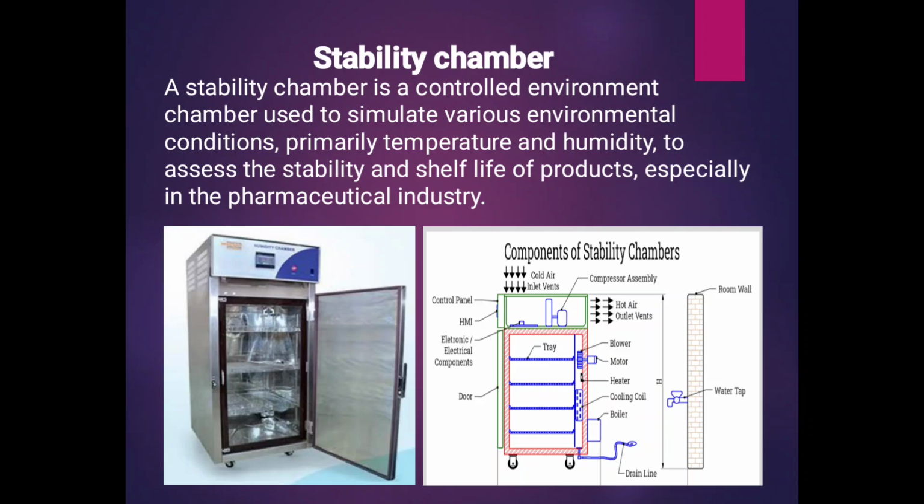In this chamber we increase the temperature, and different temperature conditions are maintained to assess the stability.